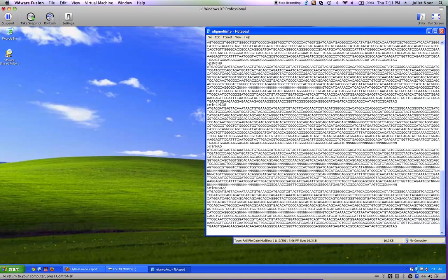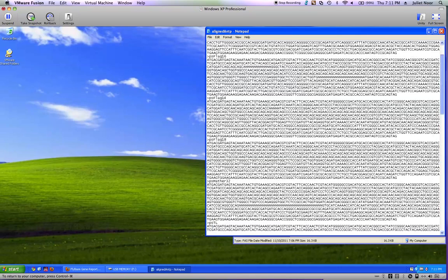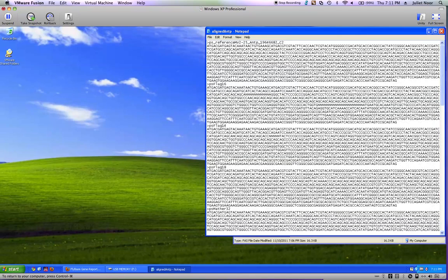If for some reason the carriage returns weren't there and it was hard to see those strain names, you can just go in and add the carriage return right before that greater-than sign, before the strain name, to make it a little easier to deal with.